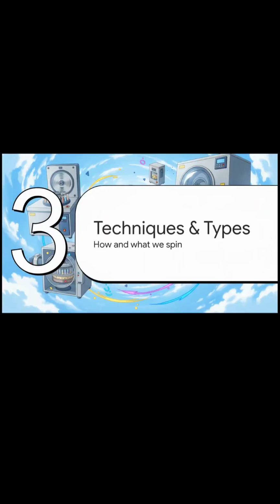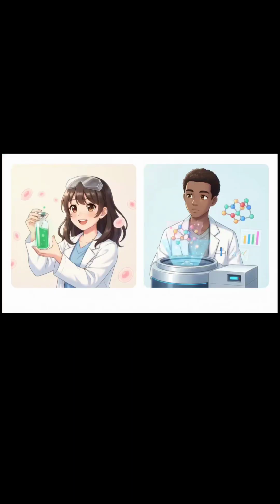Section 3. Techniques and machine types, how and what we spin. At a high level, the scientific community essentially splits centrifugation into 2 main techniques. Over on the left, preparatory centrifugation is all about isolation and purification. This is your go-to when you want to extract specific biochemical components. Think cells, membrane vesicles, or viruses.